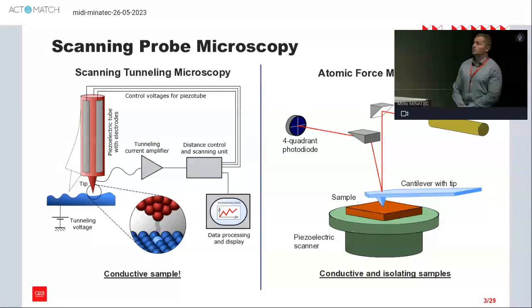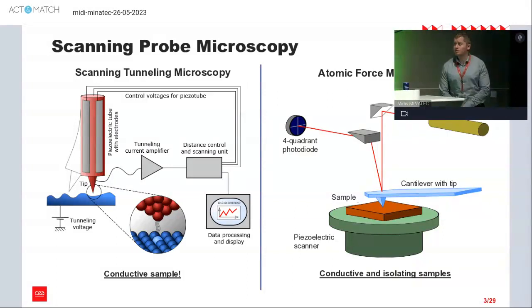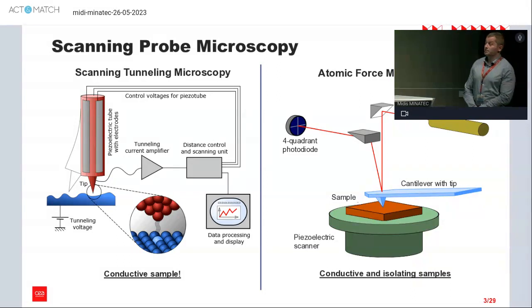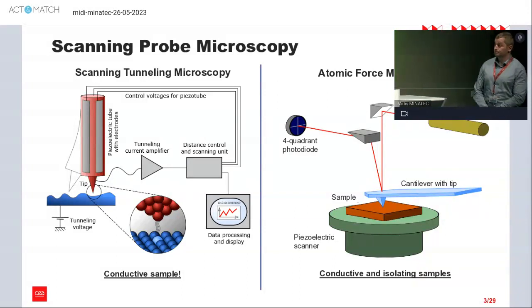The laser is focalized on the end of the cantilever and reflected to a four-quadrant photodiode. By this photodiode, we can read the signals from the cantilever, for example, deflection of the cantilever or amplitude set point, to use the scanner and to scan, for example, topography, etc. But I will talk about this later.